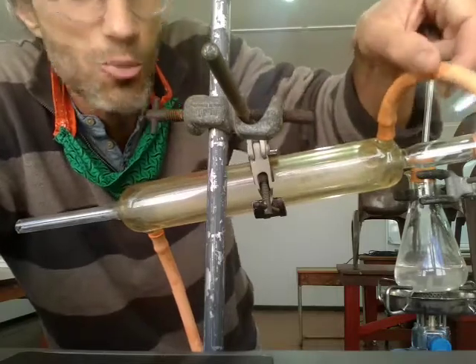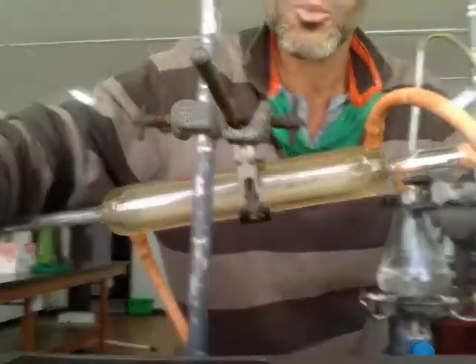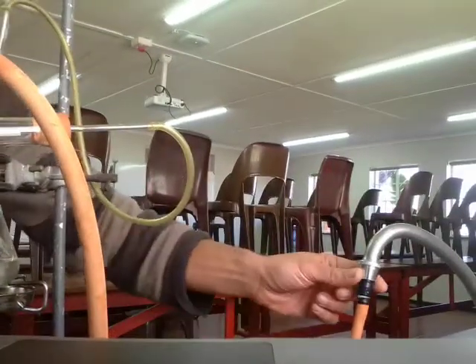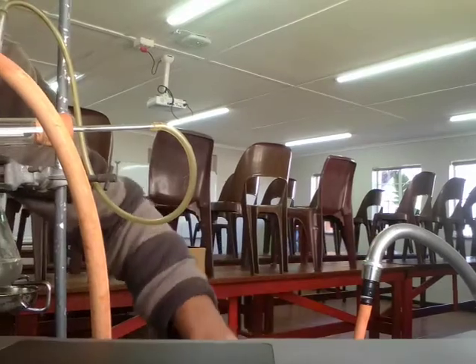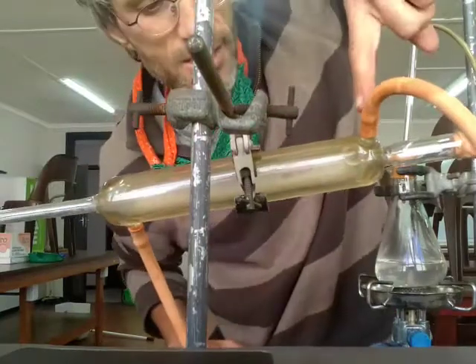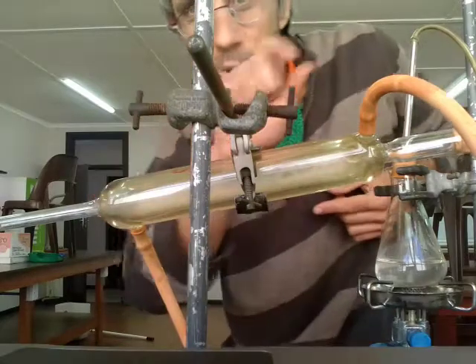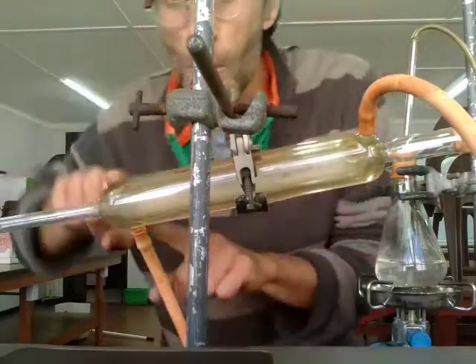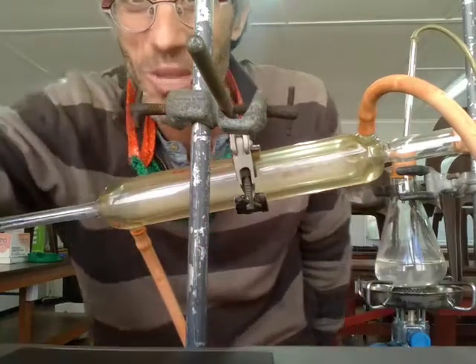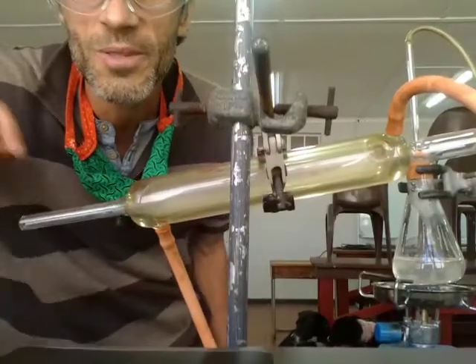So you can see this tube here. If I go over with this tube, I'll just spin you around a little bit, you can see that I'm connected to the sink, to the tap. So water will go through this orangey tube, get to here, and go around the container where the water vapor goes through, and then it will go back from here and pour into the sink. And it will hopefully cool our water. Shall we give it a go? I'll just pause it here, get started in a minute. Okay, let's give it a go.